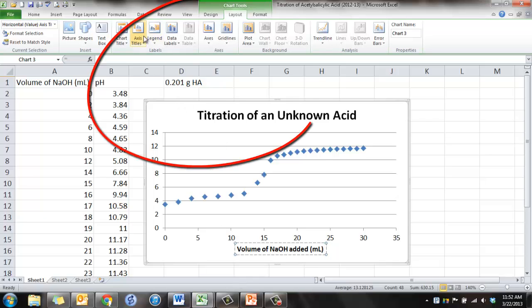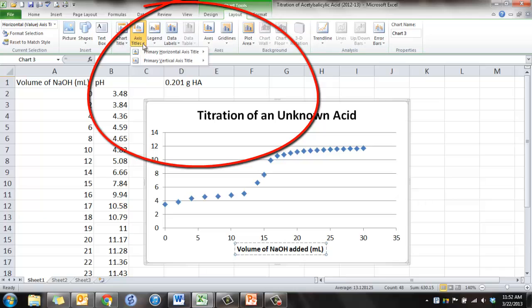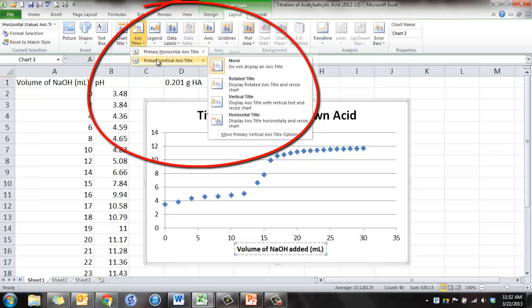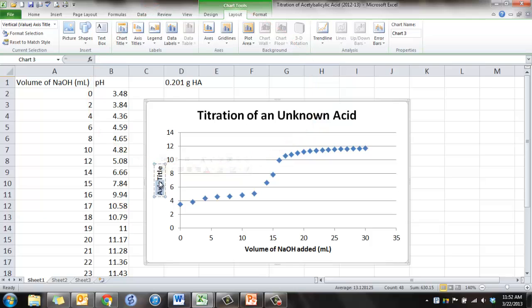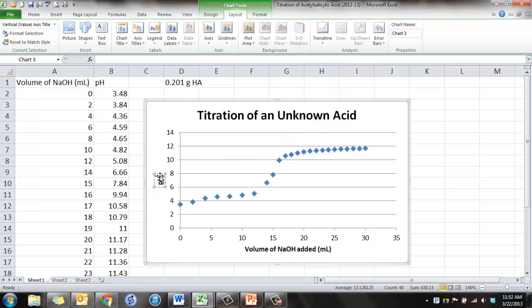Same thing, let's do axis, vertical axis this time. And we're going to do the rotated title like this. And this axis represents the pH.